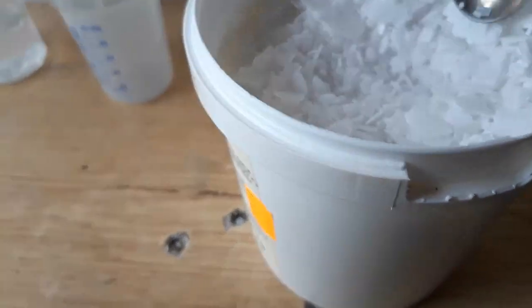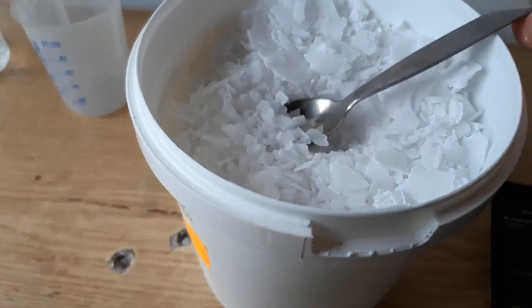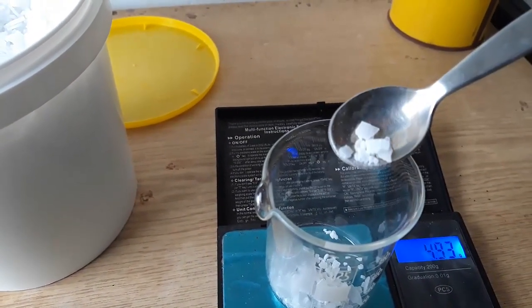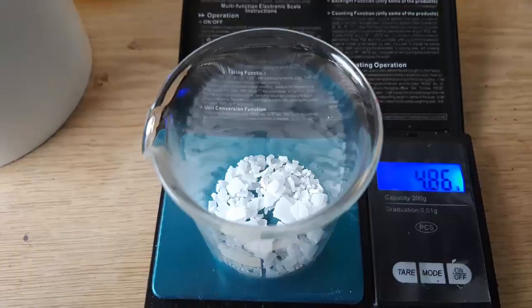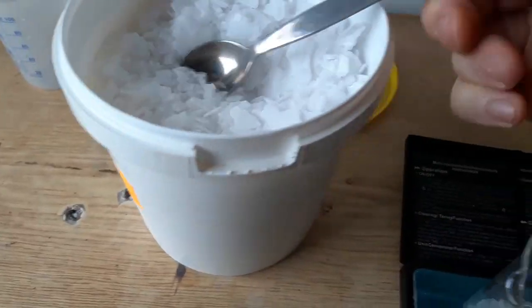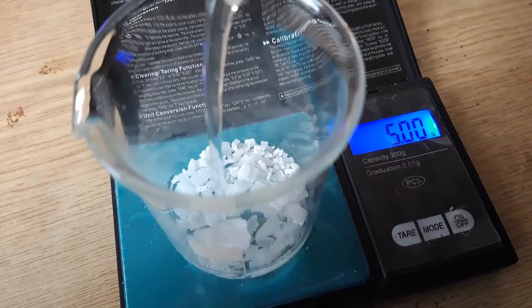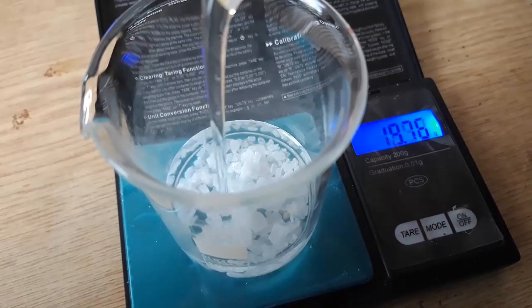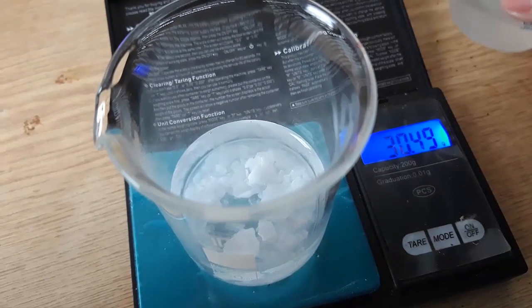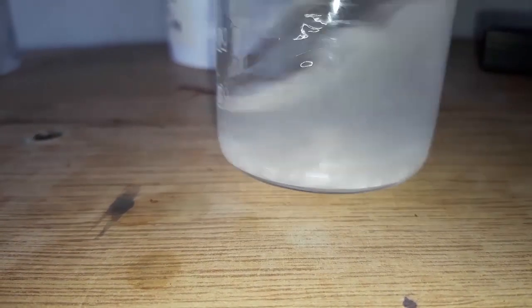First of all, we'll need to weigh out 5 grams of sodium hydroxide. We add about 30 milliliters of water to our sodium hydroxide and mix until everything dissolves.